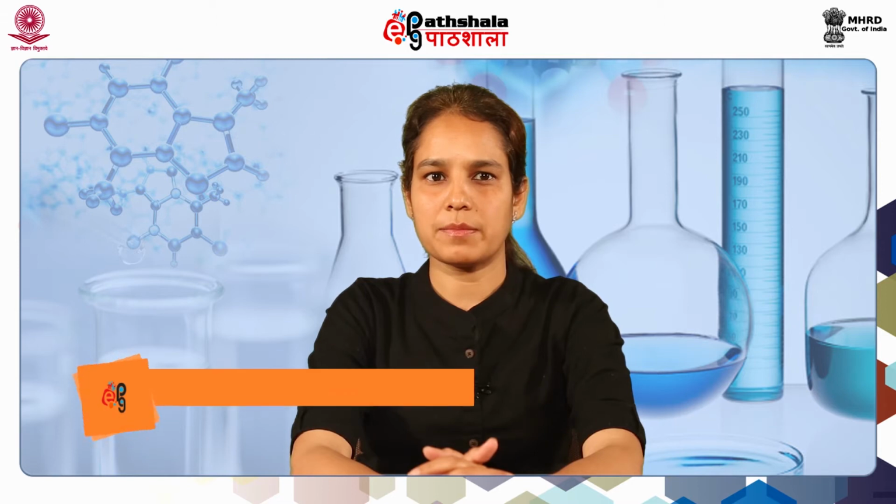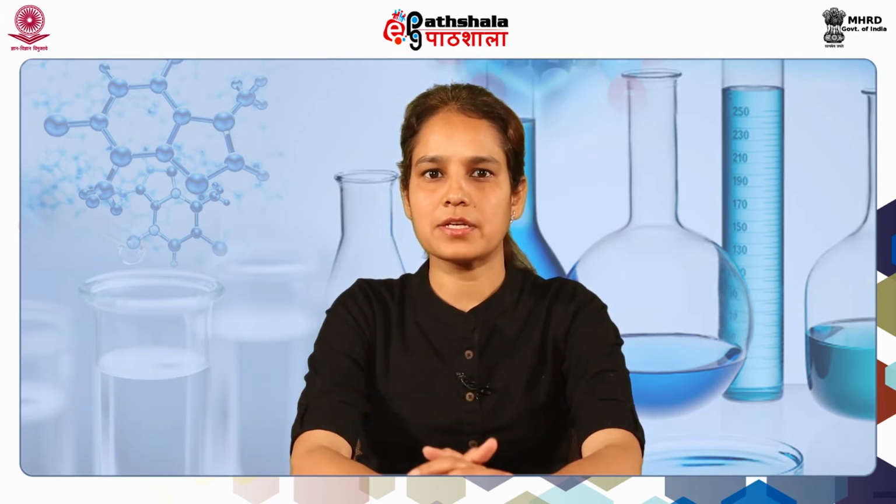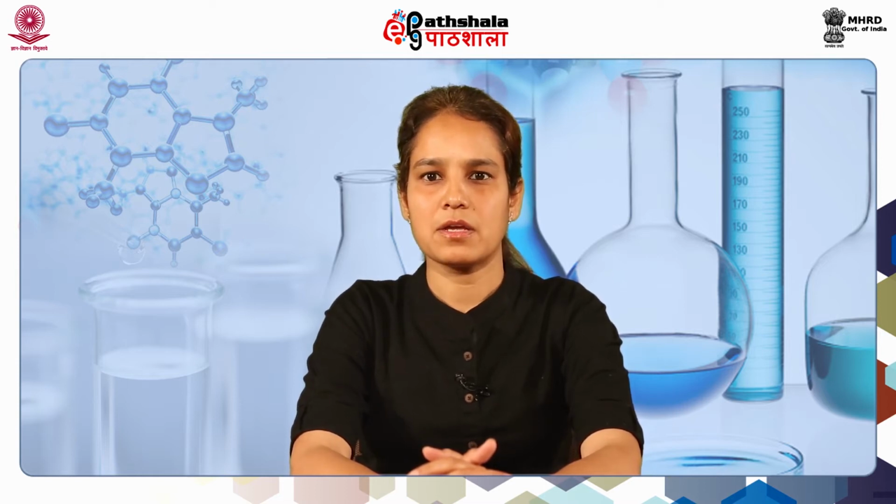I am Dr. Sunita Meena, scientist in Animal Biochemistry Division of National Dairy Research Institute, Karnal. Today, I am going to teach you the technique of UV visible spectroscopy under paper Biochemical Techniques. Spectroscopy is the study of how light interacts with matter. We can use spectroscopy to determine the structure and functional groups in organic compounds. We will be learning about how to use UV visible spectroscopy.